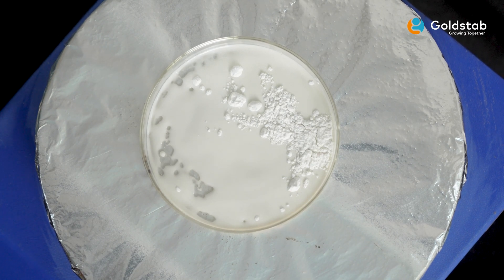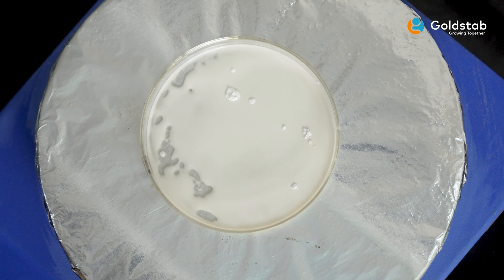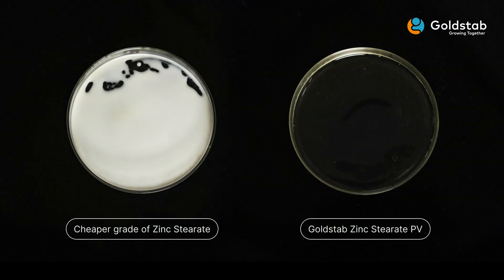For those who do not have a hot plate and glassware, you can also do this test on an extruder die head or a hot two-roll mill and get a fair idea of melt clarity and hence the quality of zinc stearate. And there you have it — a quick and straightforward method to check the quality of zinc stearate in just five minutes.